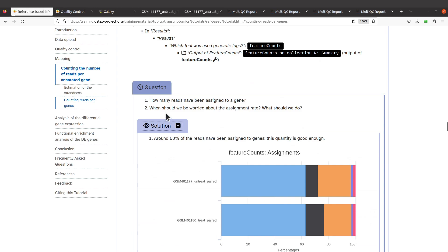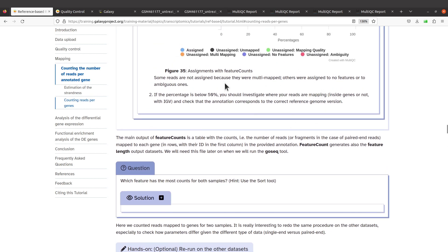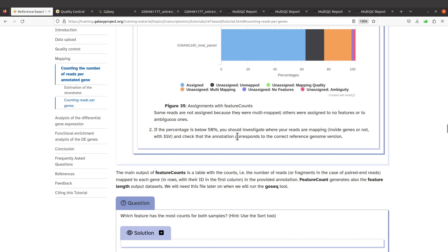The tutorial also addresses when we should be worried about the assignment rate. If the percentage is below 50%, then we should investigate whether the reads are mapping inside genes or not. This is where IGV comes in — with IGV, you can visualize the alignment records and that will help you. You should also check that the annotation corresponds to the correct reference genome version. For example, the reference genome used for mapping and the GTF file used for feature counts should be the same version.